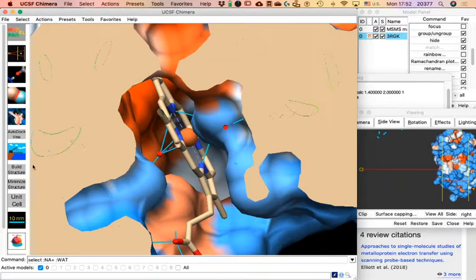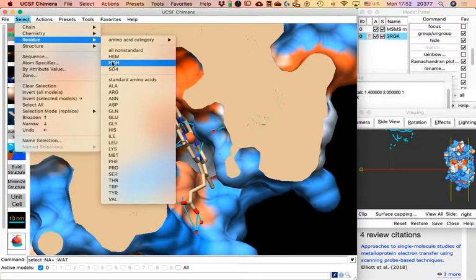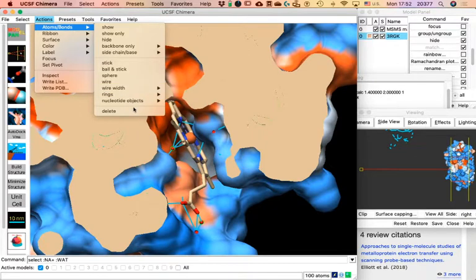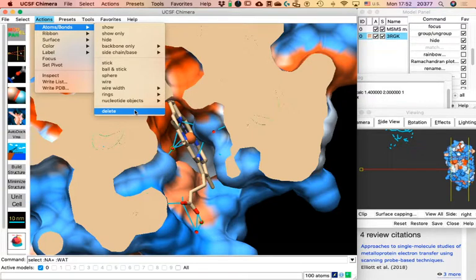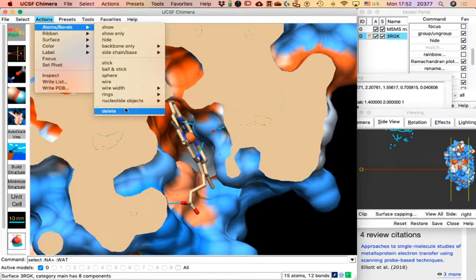Now let's do something else before you go. Click on Select, then select HOH — the water molecules — and in Actions > Atoms and Bonds, choose Delete. What I'm asking you to do is literally select water molecules and erase them from the structure. After that, go to Select again, select the sulfate groups, and again in Actions > Atom and Bonds, choose Delete. We are removing the water molecules and the sulfate — for the purpose of an exercise, because they are not supposed to be there and we cannot count on them.